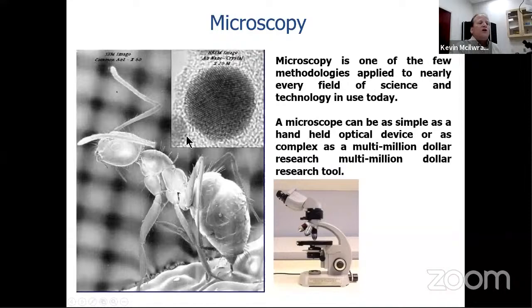So there's a number. We can have a microscope or magnifying glass to increase magnification, or we can be using a $600,000 tool like I'm sitting in front of, or a $5 million tool that would be a CS corrected fully loaded microscope, which would be here. Apollo can take orders after the meeting. Now, why do we need microscopy?